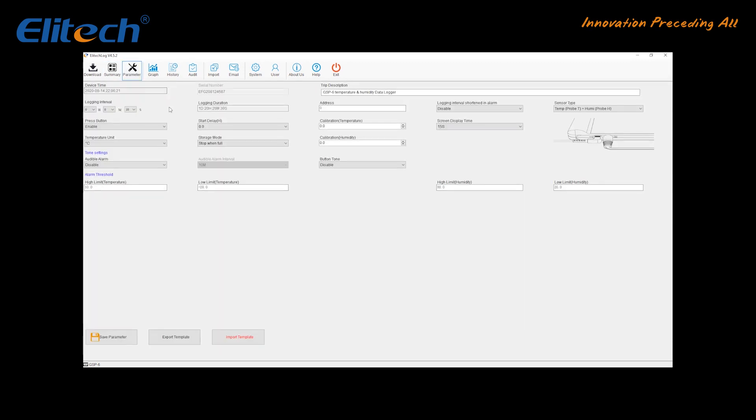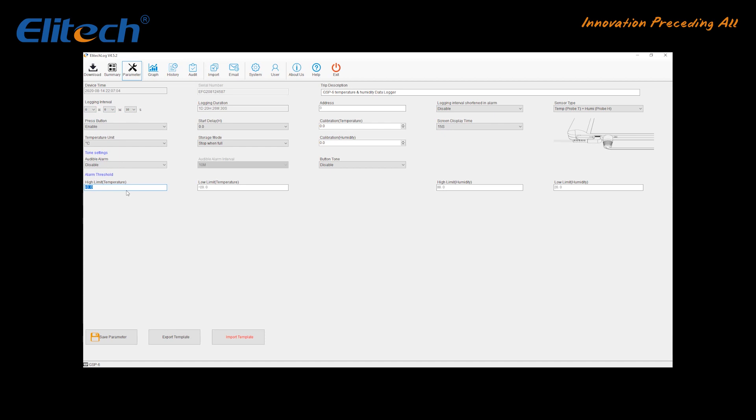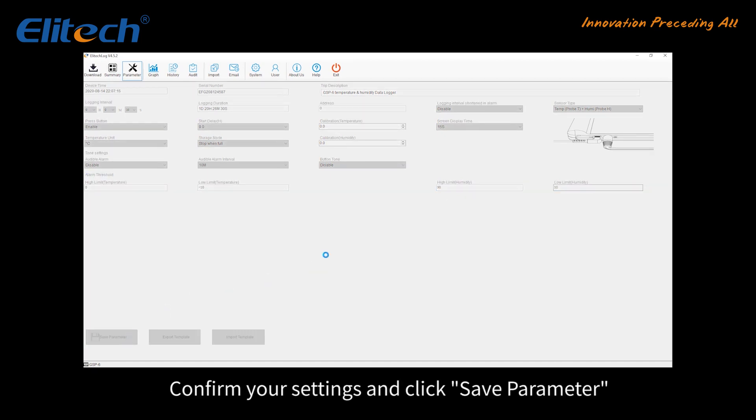If you prefer to set your own parameters, go to Parameter. This determines at what interval the measurements will be recorded. The estimated maximum recording duration changes depending on the storage cycle. Set the temperature range — if the temperature is out of range, a note will show on the device as well as in the report. Confirm your settings and click Save Parameter.